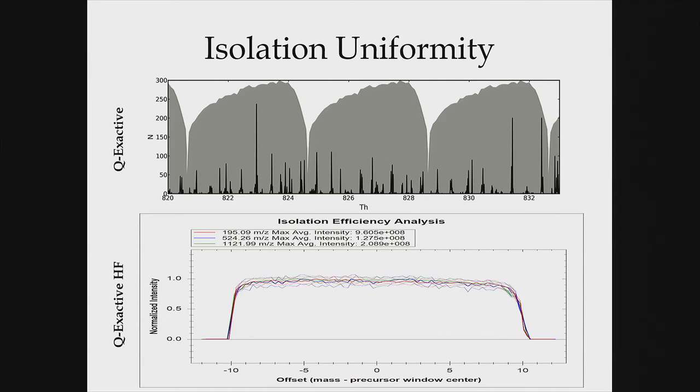Okay. Yeah, so you have to be careful with it. You really want to avoid having too many things that are on the very edge. So it would be kind of crummy to have it like say right here. So this point right here is -10, and this point here is about 0.5 away from it. So it's one thing's bad and one thing's really bad.